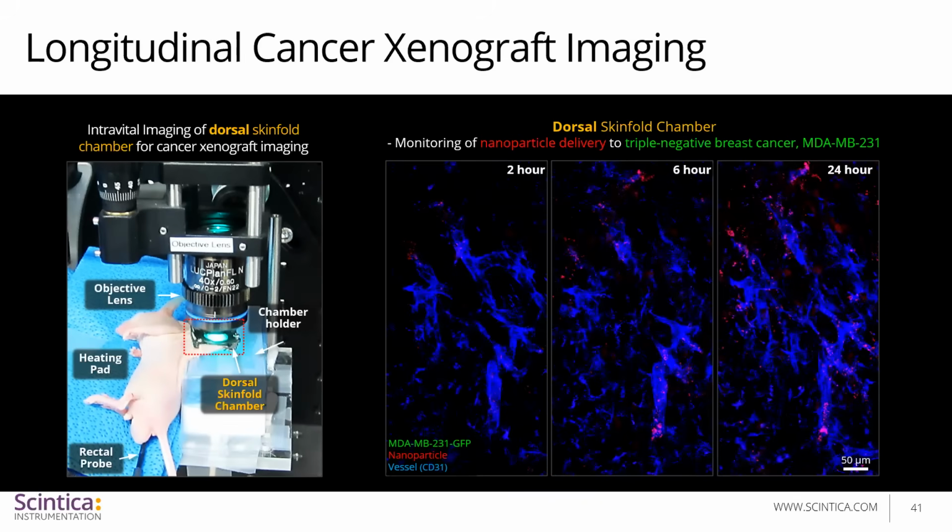That way you can appreciate that indeed there are more nanoparticles entering and extravasating from the bloodstream and accessing the tumor site. Of course, when you're analyzing this image, you would analyze every channel separately. So this is just a tip for visualization purposes.